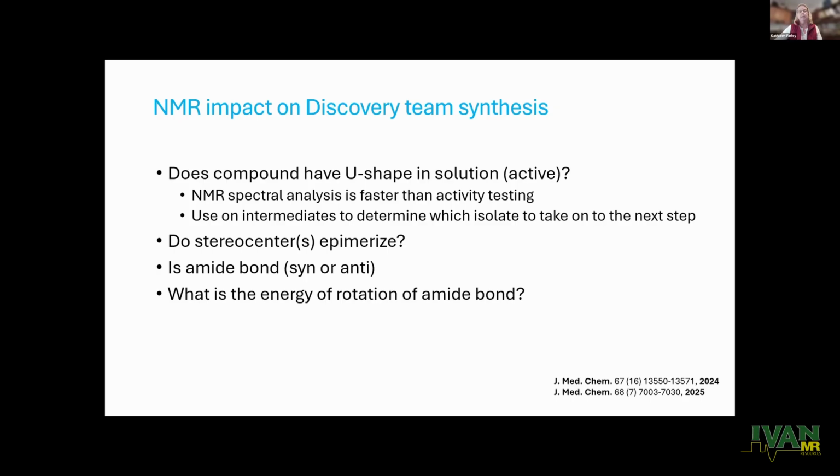Because we had stereocenters, we had to worry about epimerization. It didn't happen so much during the chromatography, but it happened sometimes during the chemistry with some of the harsh conditions they needed to use. So chemists were very keen to make sure their compound had not epimerized.